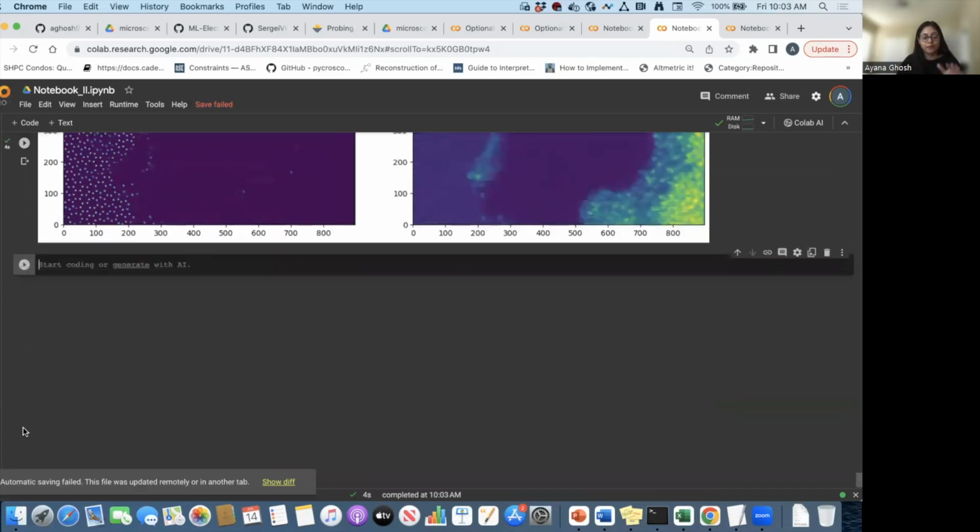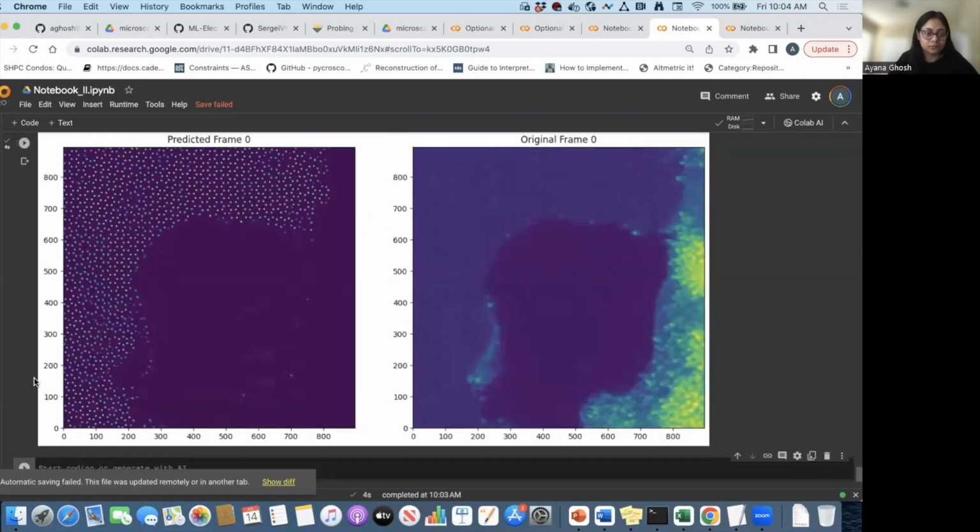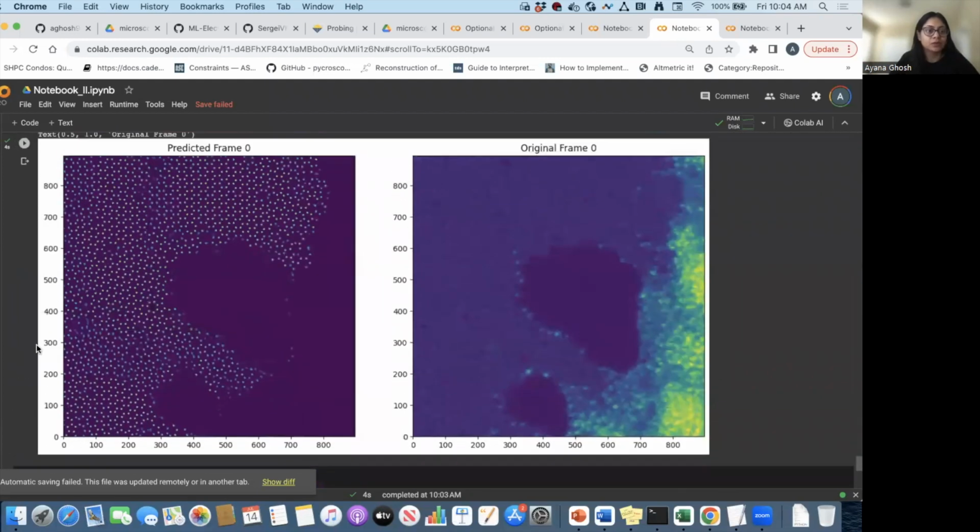But essentially, you will see by the end of it, and that's essentially the ELITE original paper, that we start from simulated data that was only trained on carbon atoms, and not necessarily any defects were there. We were just pulling out different atoms initially. And then we went from that to predicting the features that are associated with the carbon atoms as well as the impurities. So that's something you could also do.